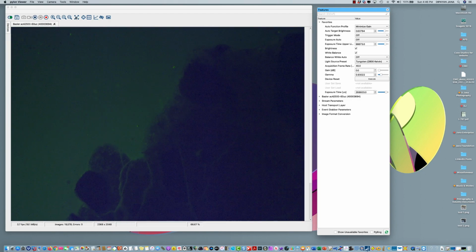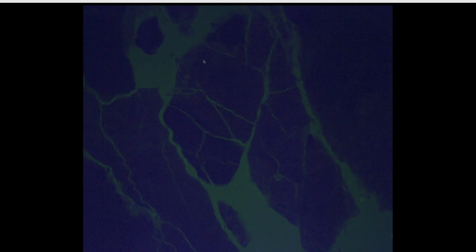I can maximize the image to see, and I can move the stage to show the cracks, the voids, all the open areas that are filled with fluorescent epoxy are highlighted beautifully in the fluorescent light mode. And fluorescent light microscopy is a very popular contrast enhancement technique used in concrete petrography by impregnating the thin sections with a fluorescent dye mixed epoxy.